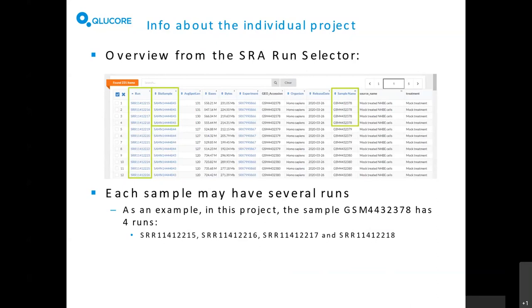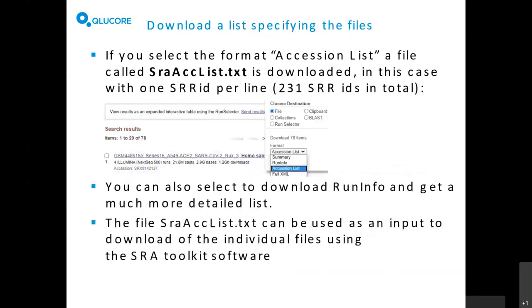As you can see, there are often several runs per sample. If you'd like to download all that information you can do so in different formats. One format is the so-called accession list — a text file you can download for humans only, ferrets only, or a combination. You can also download the run info for much more detailed information. The SRA accession list text file can be used as input when downloading individual files using the SRA toolkit software.